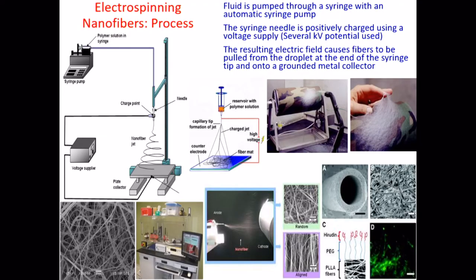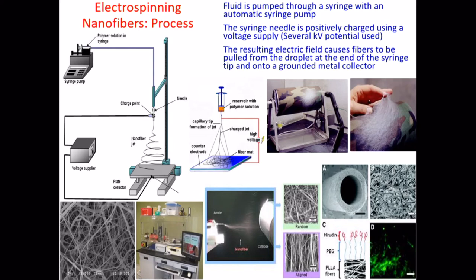We can prepare fibers also. All right, these fibers I have shown some applications, right? They can also be processed if you are able to make a polymeric solution of the material. For example, I have shown zinc oxide or titania or silica, right? You make a polymeric solution and inject it with a syringe, right? You apply a potential, right? This is a simple example. This is a syringe containing the polymer solution, and you apply a voltage from the top and bottom electrode. This is the plate. The fibers will come down and settle at the plate.